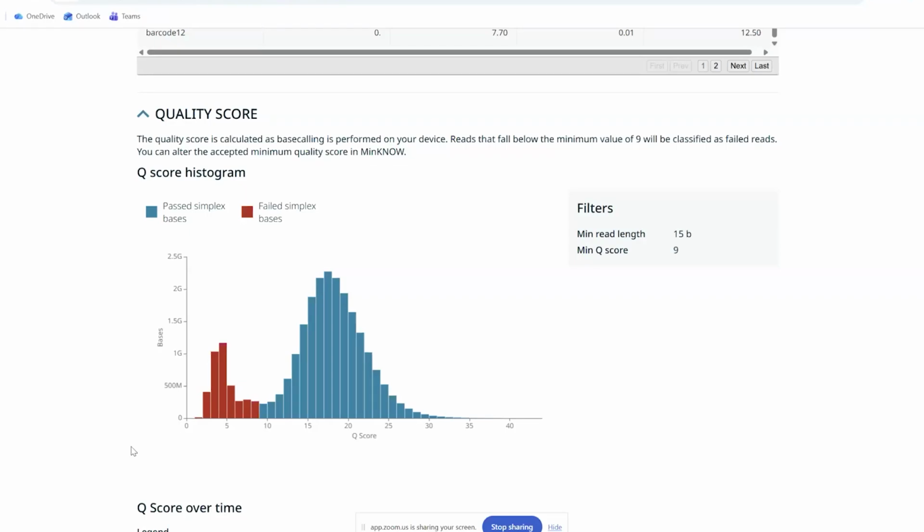I think when Billy Lau does his analyses, they go down to Q7 for quality score filtering. But other groups will filter by alignment, so if something doesn't align to the reference, or align unambiguously, they'll discard it.